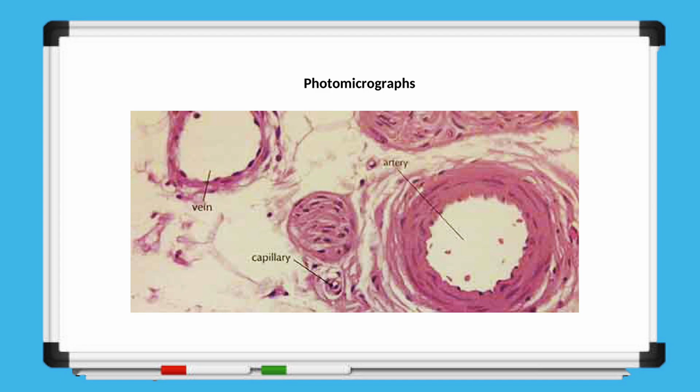system. Arteries have significantly thick walls made up of prominent smooth muscle and elastic tissue layers. This allows them to withstand the high pressure of blood being pumped away from the heart. Their lumen, the internal passageway, is relatively narrow and usually maintains a round shape in cross-section. Arteries are generally larger vessels overall.